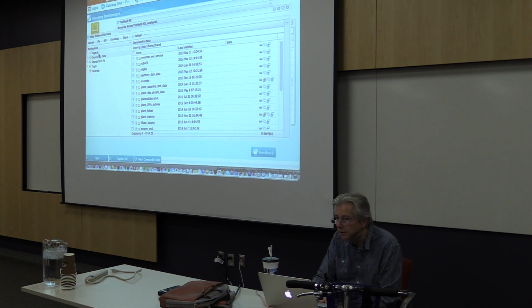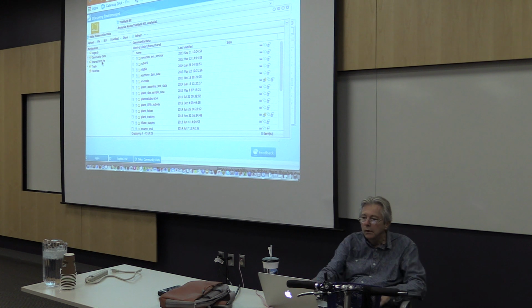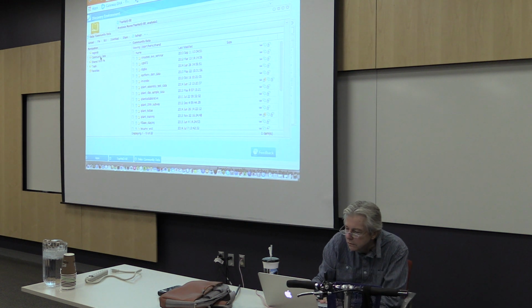By the way, if you haven't already looked at this, all up here is Roger AD. Those are all my files, and I'll tell you, I have a lot of files in there. And community data is generally iPlant community resources, and there's a lot of stuff in here, including genome sequences buried deep in there, but they're in there. And if you share files with people, or people share files with you, the ones that are shared with you will pop up here under shared with me. You may have already seen that, but it's good to review.